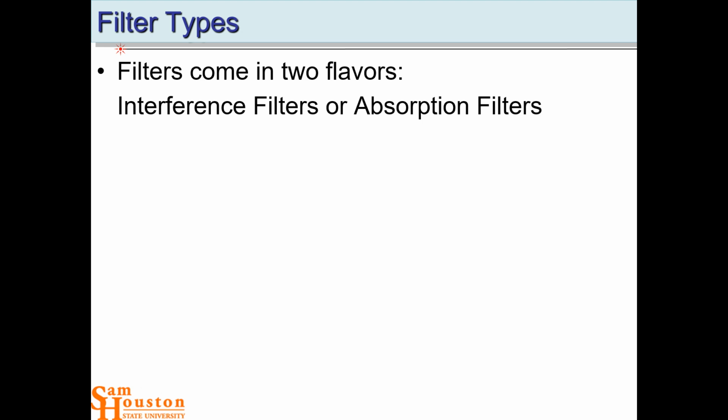The different types of filters: we have the interference filters and absorption filters. Interference filters are kind of exotic. They're really only used for laser light sources. And all the others are absorption type filters.